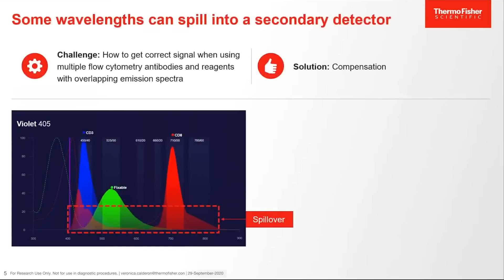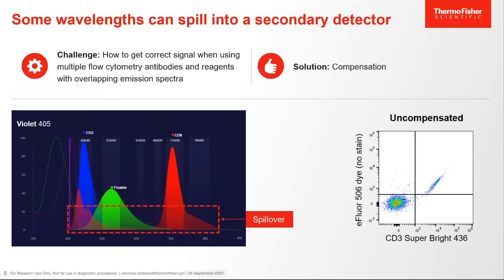The challenge is how to get correct signal when using multiple flow cytometry antibodies and reagents with overlapping emission spectra. The solution is compensation. The graph displays the spectral viewer for the violet 405-nanometer laser, showing a fluorescent marker collected in the 450-40, 525-50, and 710-50 bandpass, with spillover across different wavelengths. The flow plot shows uncompensated data collected with the violet laser. Cells stained with CD3 SuperBright 436 show spillover into the EF506 detector that does not have stain. Compensation is needed.